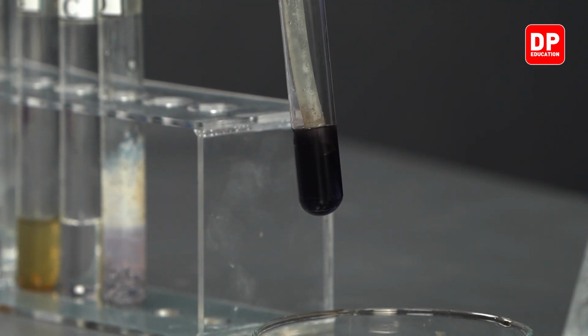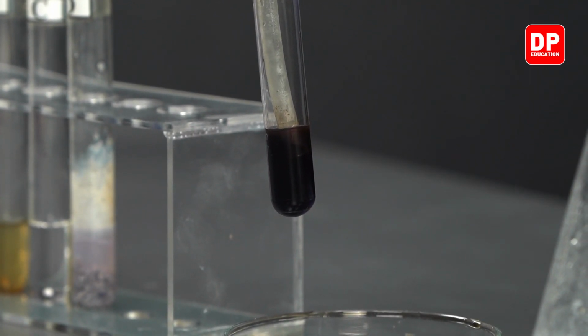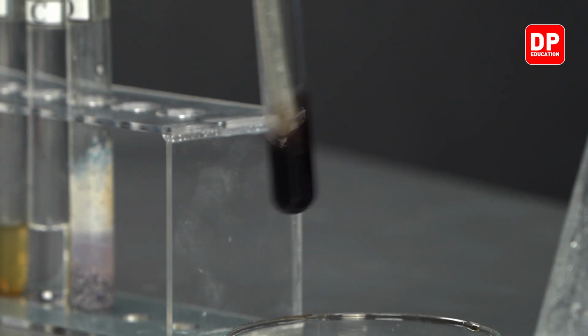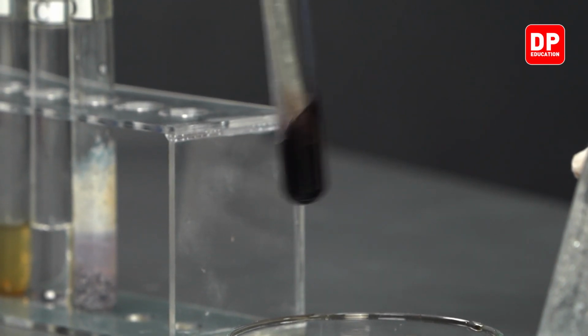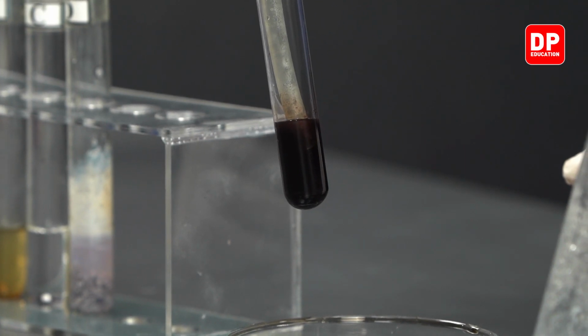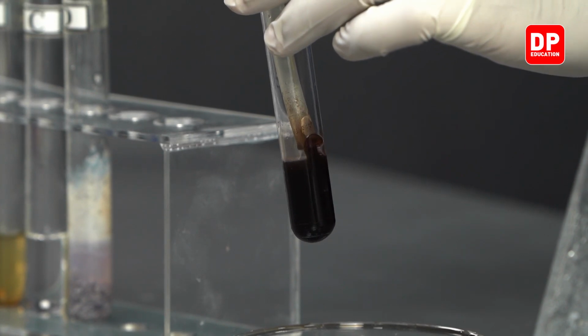This is due to formation of a reddish precipitate, copper 1 acetylide precipitate, which is somewhat of a reddish precipitate. We can see it is no longer blue in color.